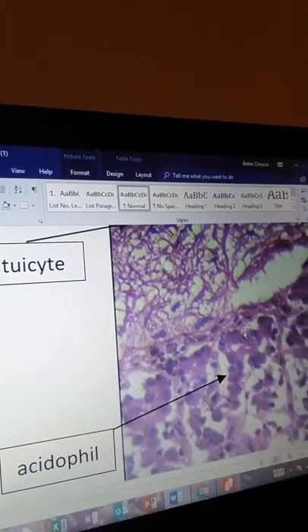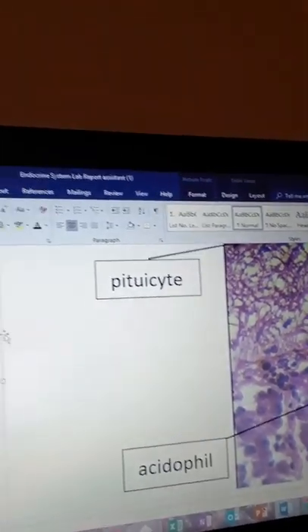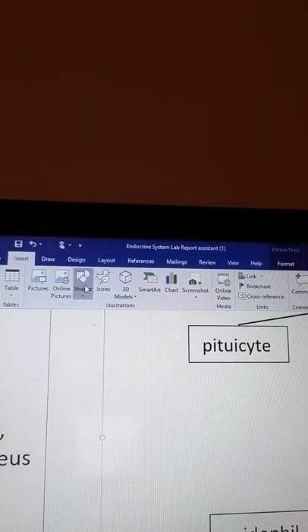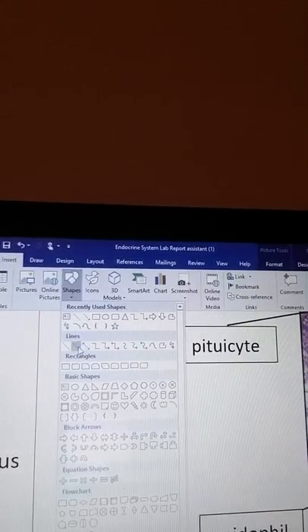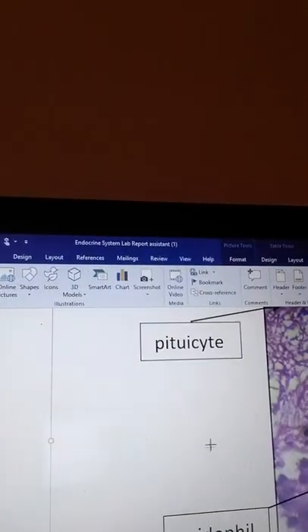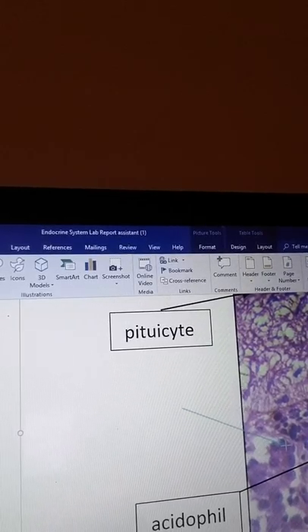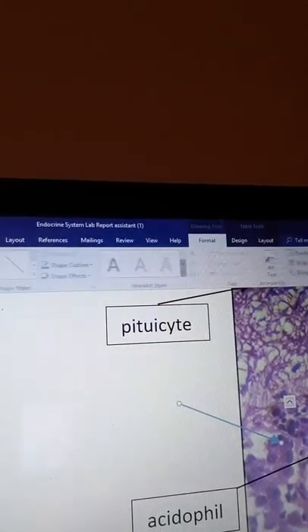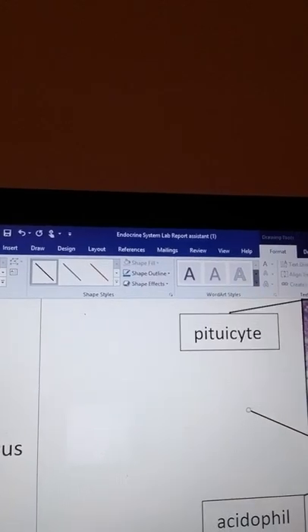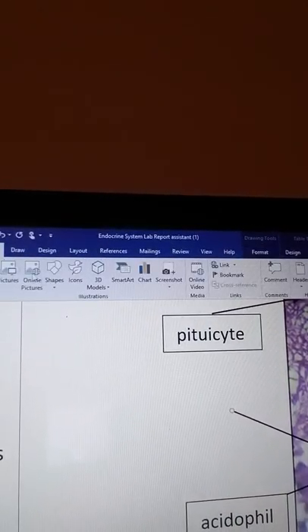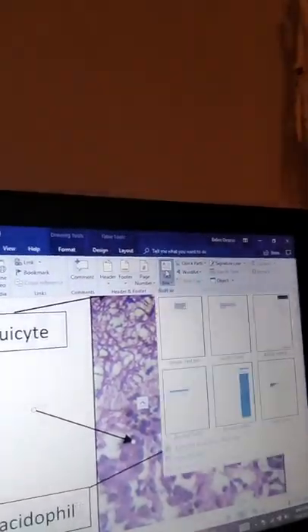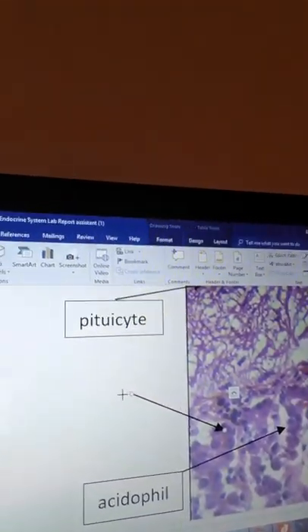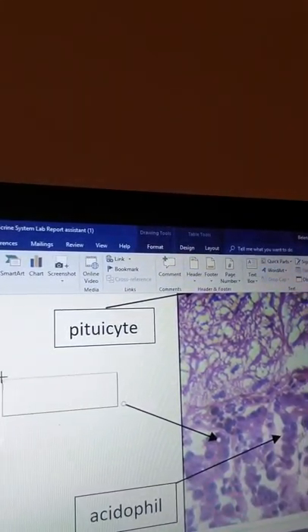So I'll go ahead and click on my image, go to Insert again, Shapes, draw my arrow, and then go ahead and point it right where I believe is the basophil.